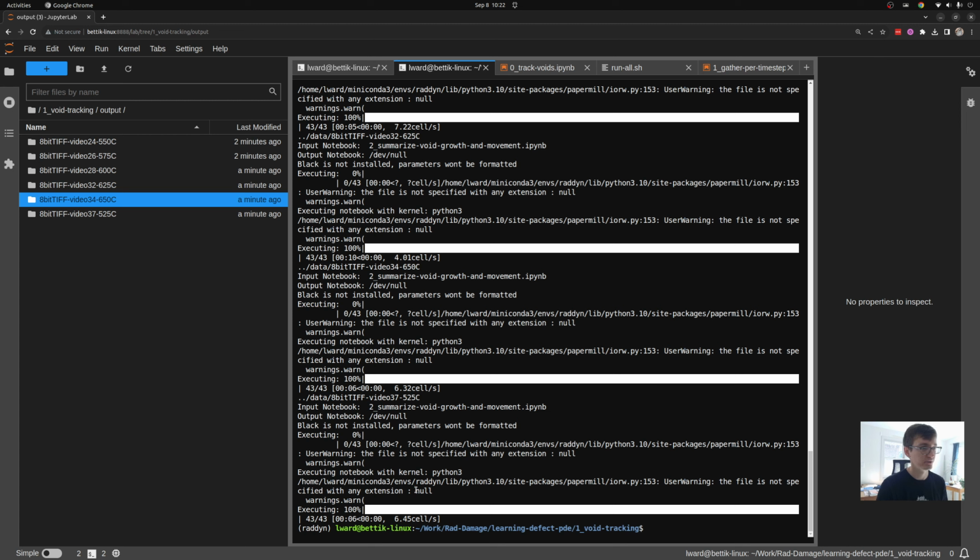And you can see it's finished here. It takes a couple of minutes for this particular example, and now I've got all of my analyses done the same way, and I can run the whole thing again if I make any changes on every single image stack within a minute or two. So overall, a really fun tool to work with, and it saves me a lot of time.